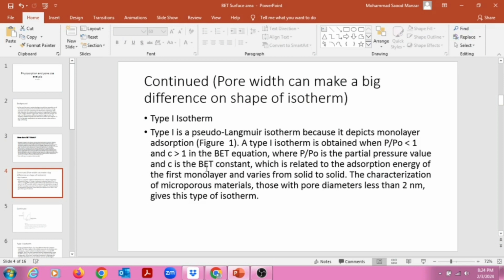So the pore width and the pore volume are important. The pore volume is the total volume of very small openings in a bed of adsorbent particles. A larger pore volume is believed to allow rapid access of the oil to the small clay particles, and therefore efficient crude oil bleaching will happen.